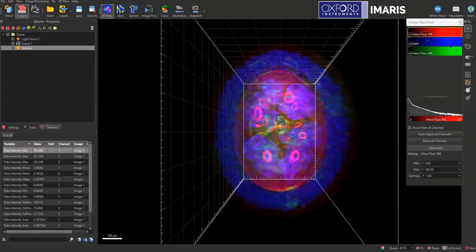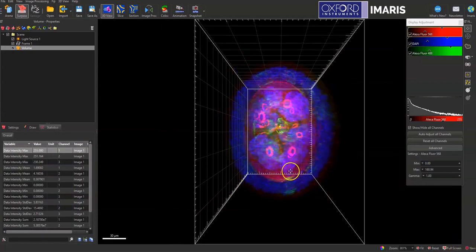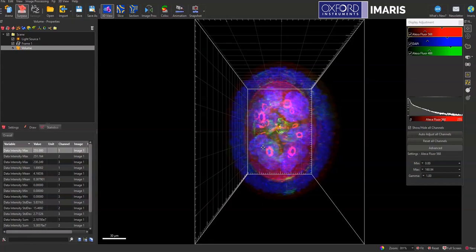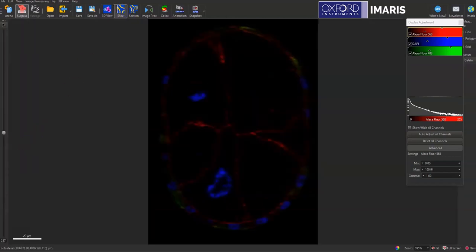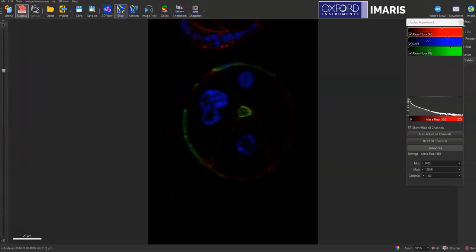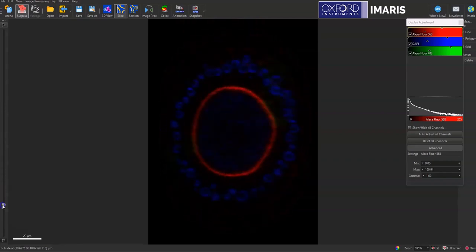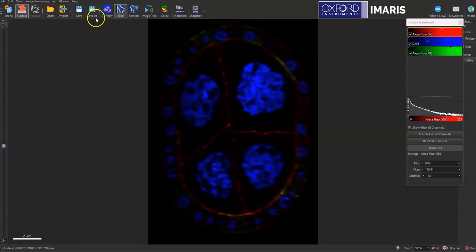And you can see here even when I select reset, this is now the correct orientation and I can see what the different Z slices are here, so they're totally different than what I had created previously.